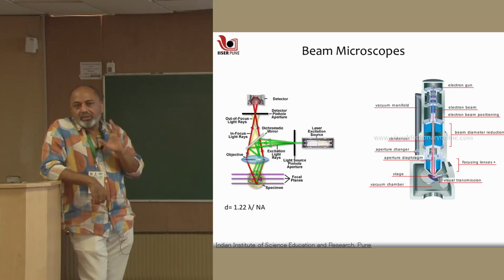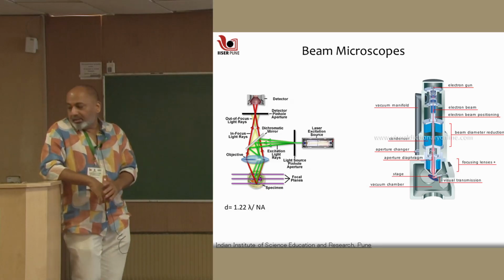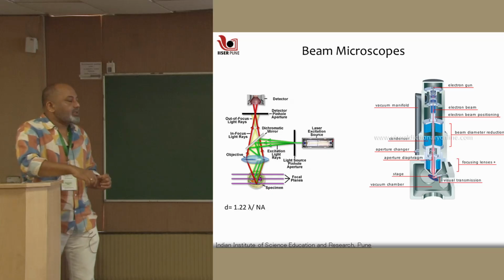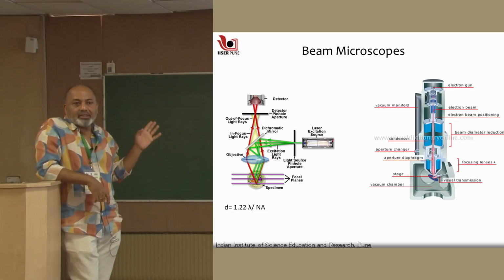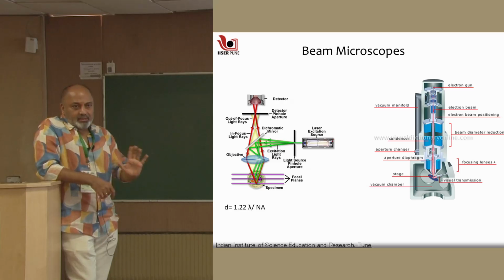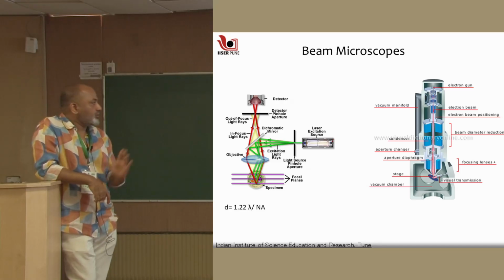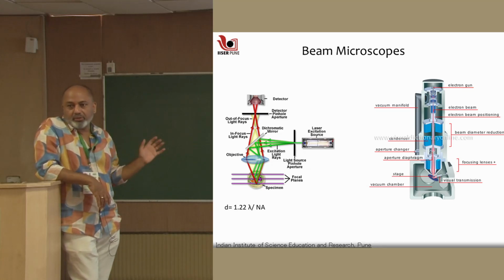100 nanometers was a really badly arranged scanning electron microscope, but 10 nanometers was quite possible. And now, of course, the transmission electron microscope and other things are giving you resolution at the scale of atoms, but that's a very recent development. This wasn't there a couple of decades ago, particularly in the 80s and 90s, when STM and AFM were invented.